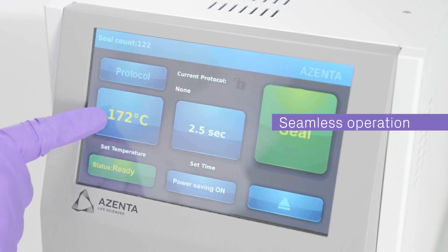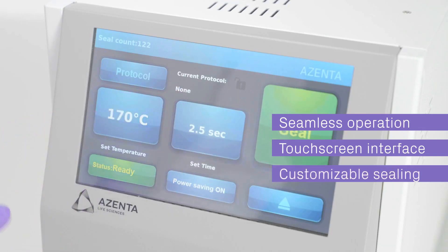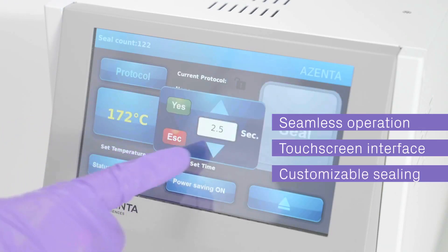Our automated roll heat sealer offers seamless operation with its intuitive touchscreen interface, allowing you to select and customize sealing parameters with ease.